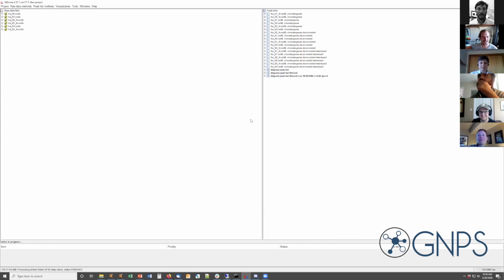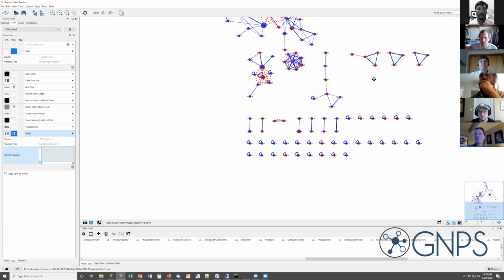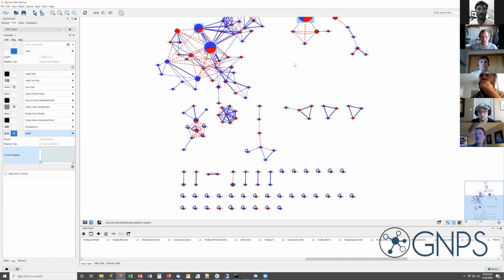Daniel, why don't we just go over it again then? There's a million nodes, it looks like, and we want to find anything that has iron bound to it. What Allegra showed you already highlighted colors based on different adducts.